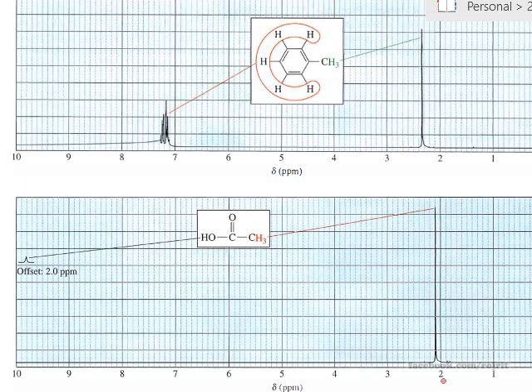And the hydrogen at the carboxylic acid, which can be partially dissociated, right? Because this is an acidic hydrogen atom, right? So it's dissociated, then your hydrogen has very low electron clouds, right? So it's strongly deshielded to the left hand. So this is offset 2 ppm. So that means this hydrogen atom appears at 12 ppm, right?